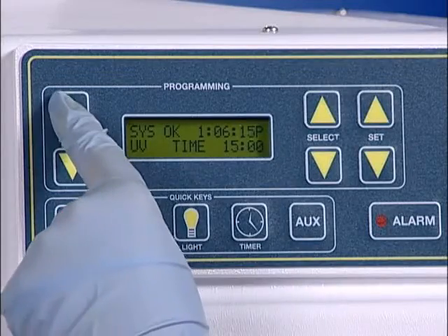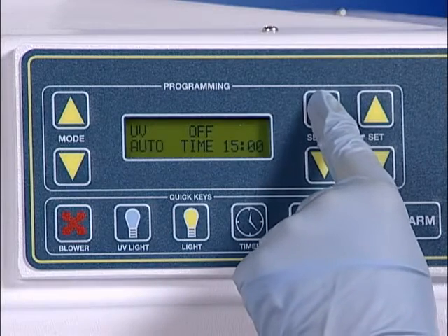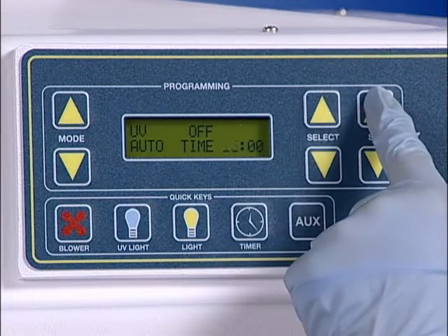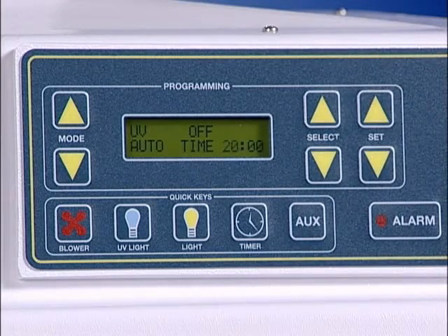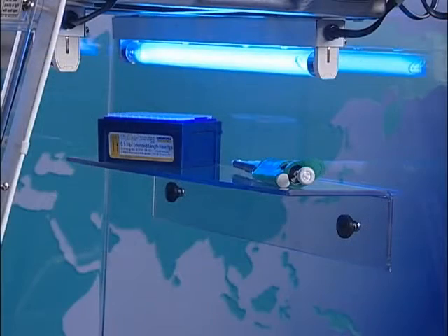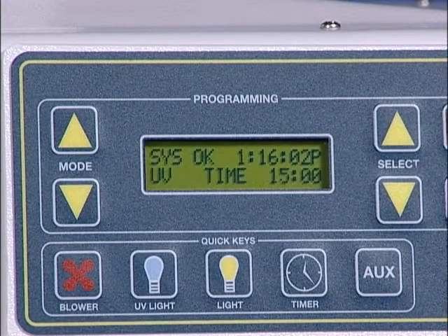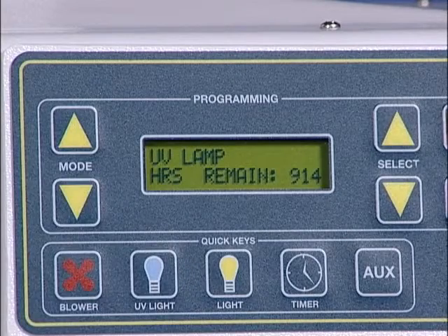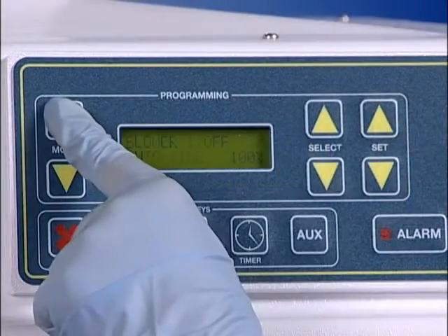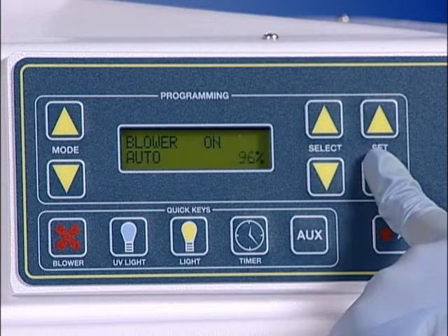A digital UV timer is incorporated into the UV tech controller, allowing the user to set the irradiation time up to 59 minutes. One of the most important features the UV tech controller provides is UV bulb monitoring. Each UV bulb has a definable useful life; UV tech monitors and alerts the operator when the useful life of the UV bulb has been reached. Replacement of the UV bulb is critical to ensure sterility between amplifications. The UV tech controller also allows the operator to manually adjust the airflow, accommodating even the most fragile samples.